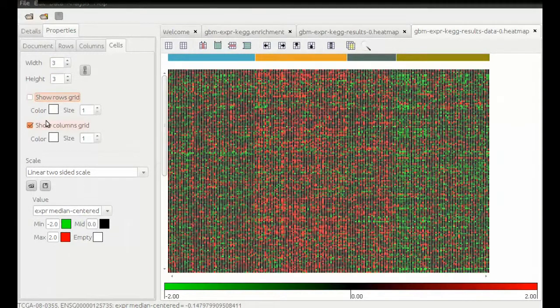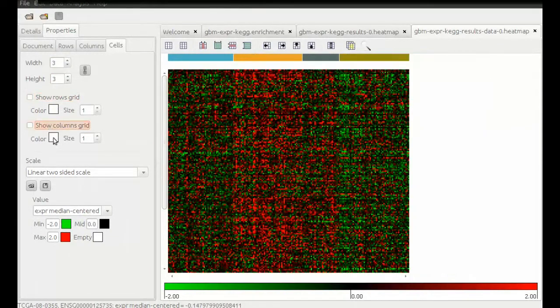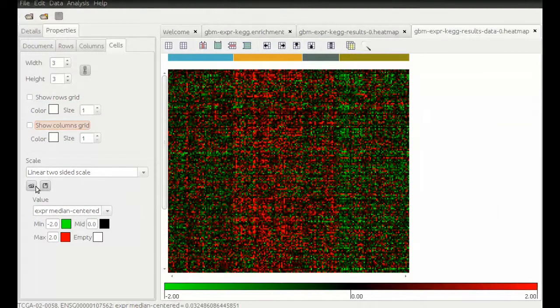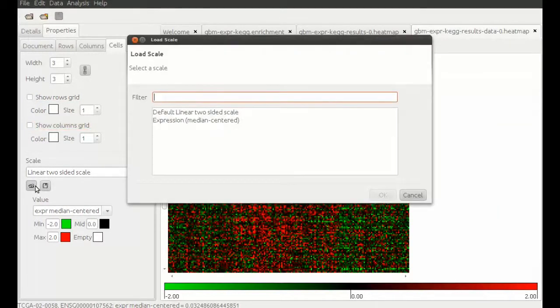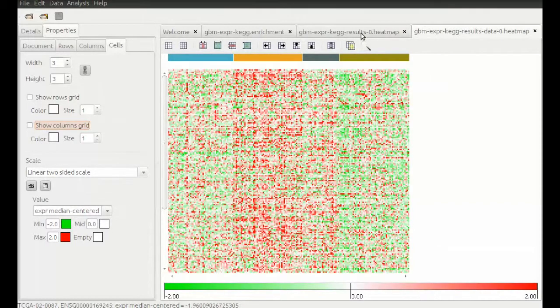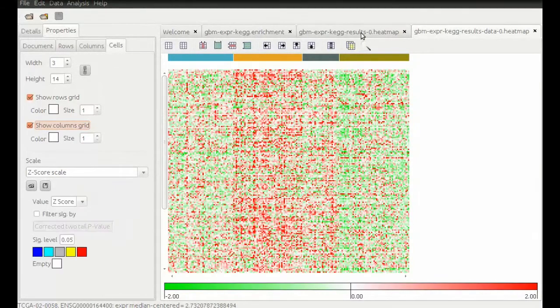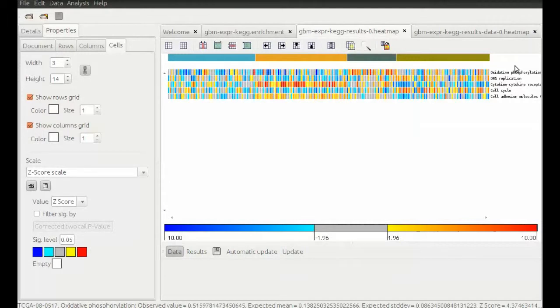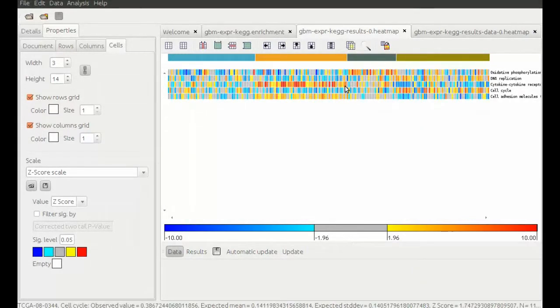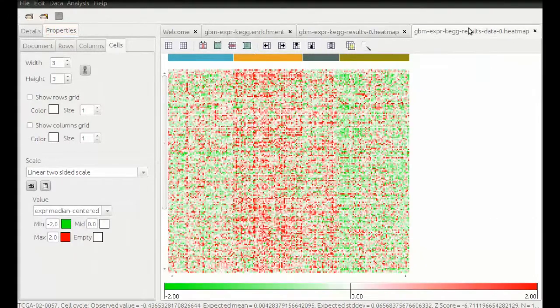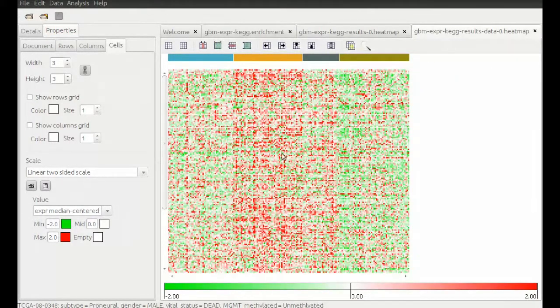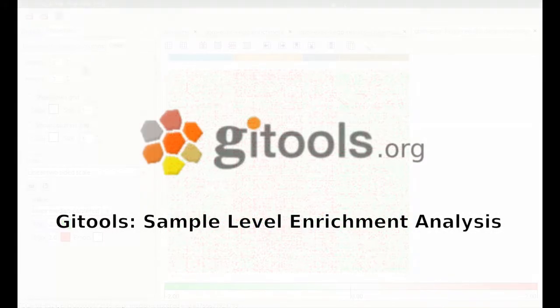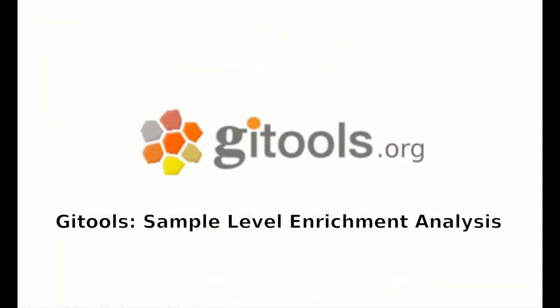Thus we can see where this data originated from, as well that there is a concordant change in expression status among the genes in the same subgroups within that very pathway. So that was how to perform a sample enrichment analysis, or SLEA.